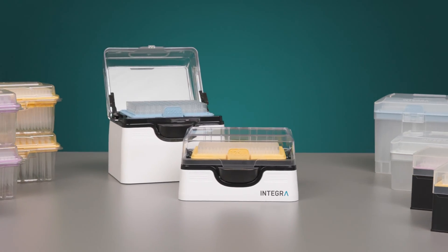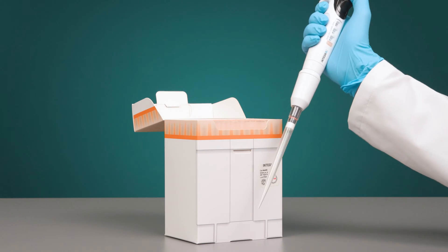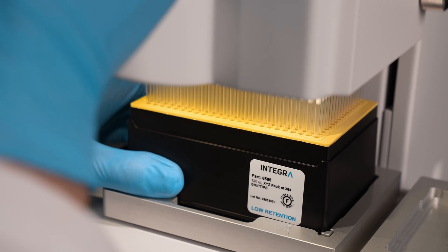Our grip tips are designed to work with all Integra pipetting solutions, from a single channel Evolve manual pipette, all the way up to our Viaflow 384 Benchtop Pipette.